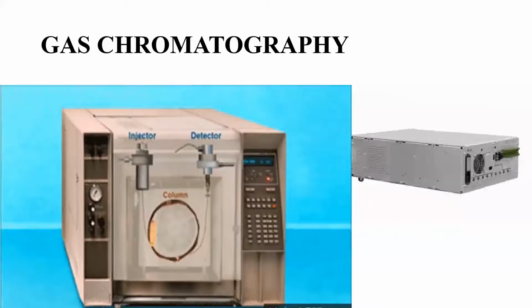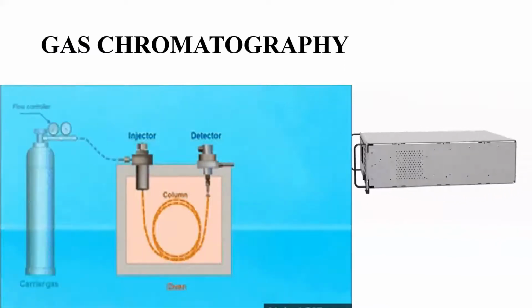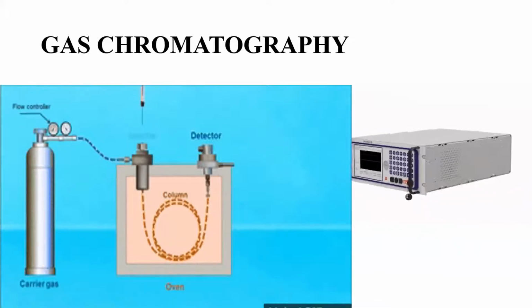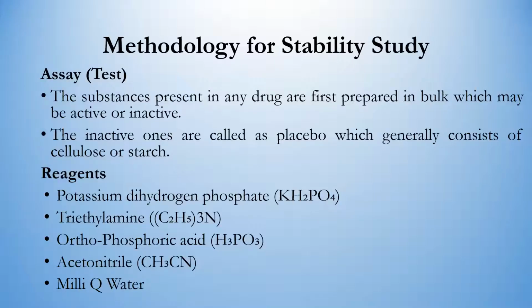So in this video, you have learned about how to work with HPLC. Another one is gas chromatography. Here you can see the injectors and the gas chromatography. Now we'll discuss what types of methods are there for stability study.